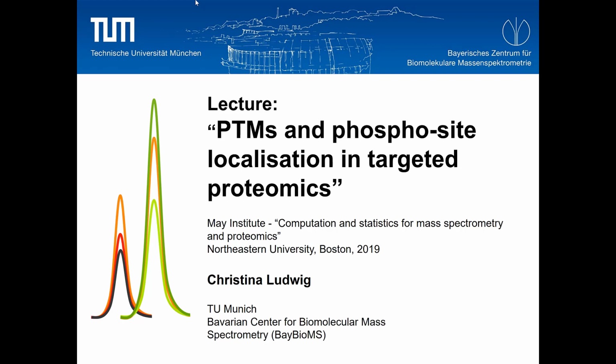So now at the end of the day, I hope you will still stay awake another hour, stay with me, because now the topic of the last hour of the day will be all on PTMs, on post-translational modifications, and on phosphosite localization using targeted proteomics.